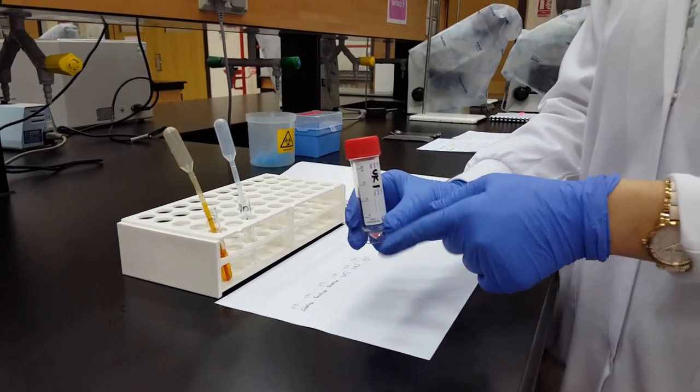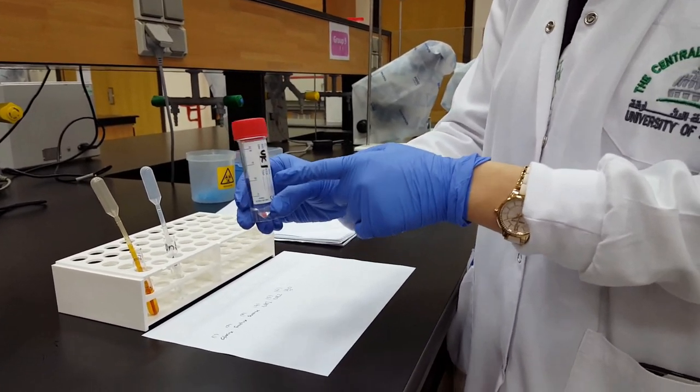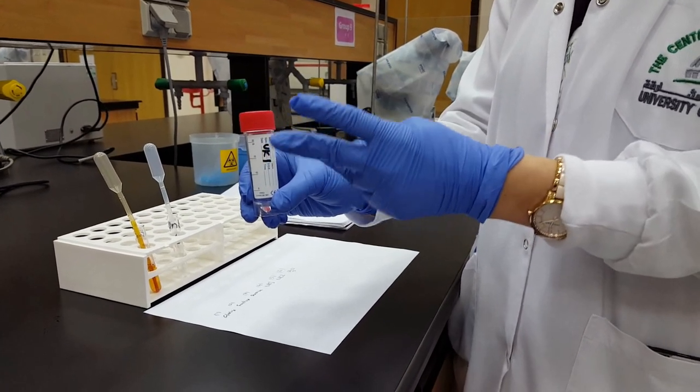In the first test, the Molisch test, we have confirmed that our unknown one is a carbohydrate. Then we have to find out whether it's a polysaccharide, monosaccharide, or a disaccharide.